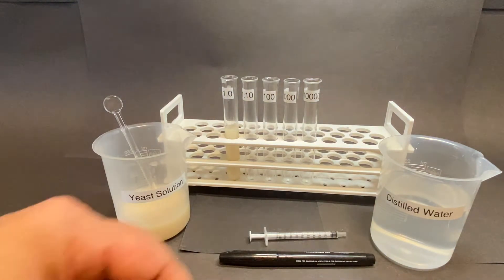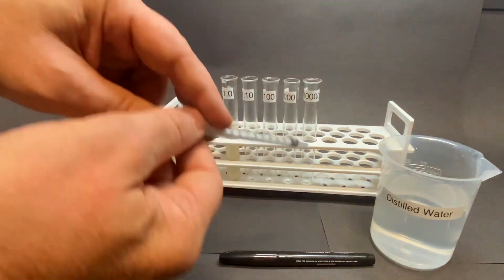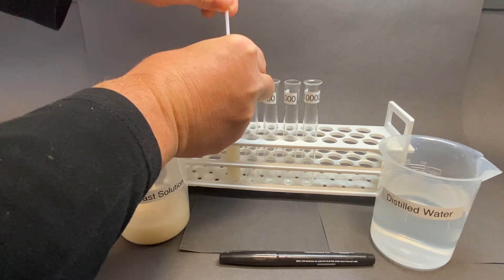Then, using the 1-milliliter syringe, draw up 1 milliliter from the initial sample and deposit this into the test tube marked 1 in 10.